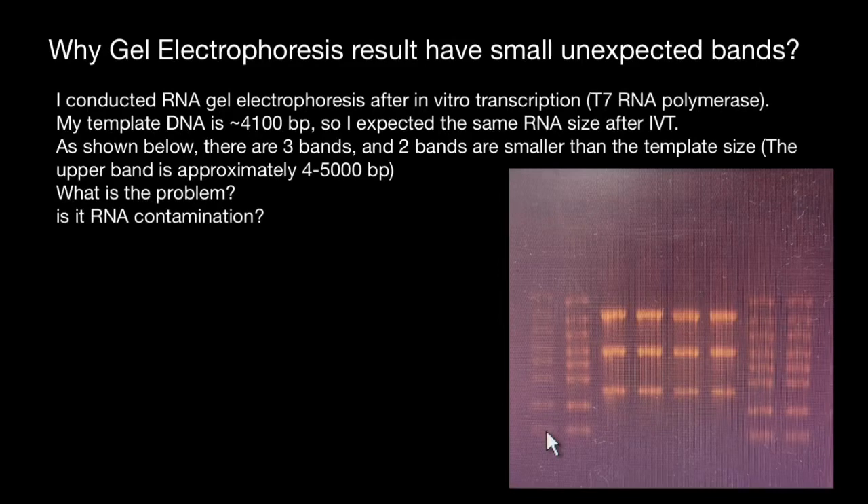Hello and welcome to Nikolai's genetics lessons. Today we are going to talk about real case gel electrophoresis — specifically why gel electrophoresis results have small unexpected bands.